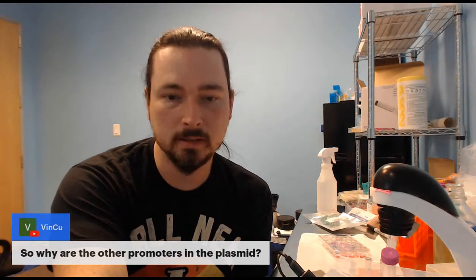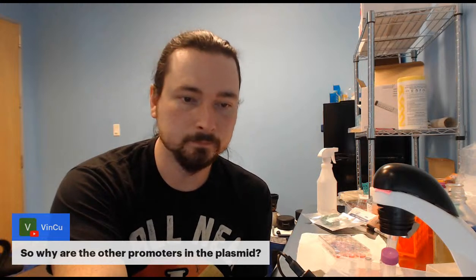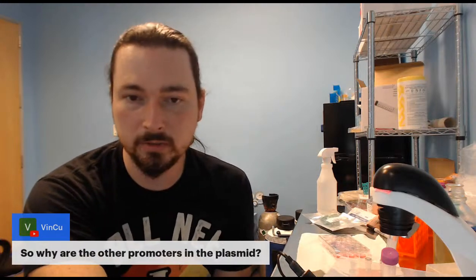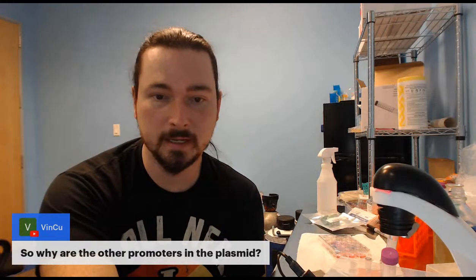So why are the other promoters in the plasmid? Okay, this promoter is here to promote ampicillin resistance, so that you can replicate the plasmid in E. coli, just for the sake of manufacturing the plasmid.